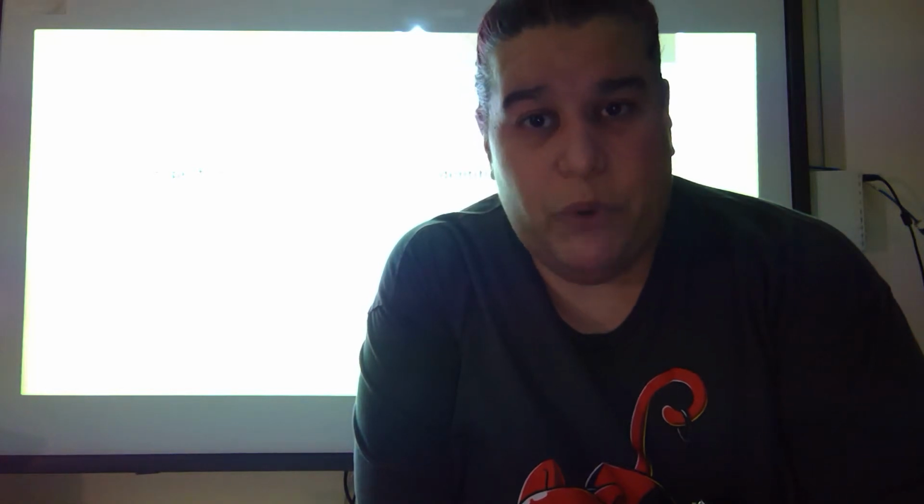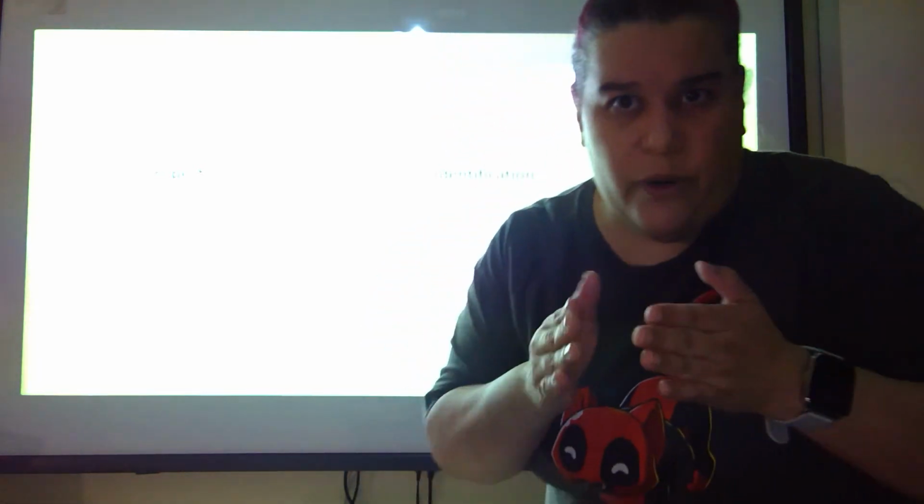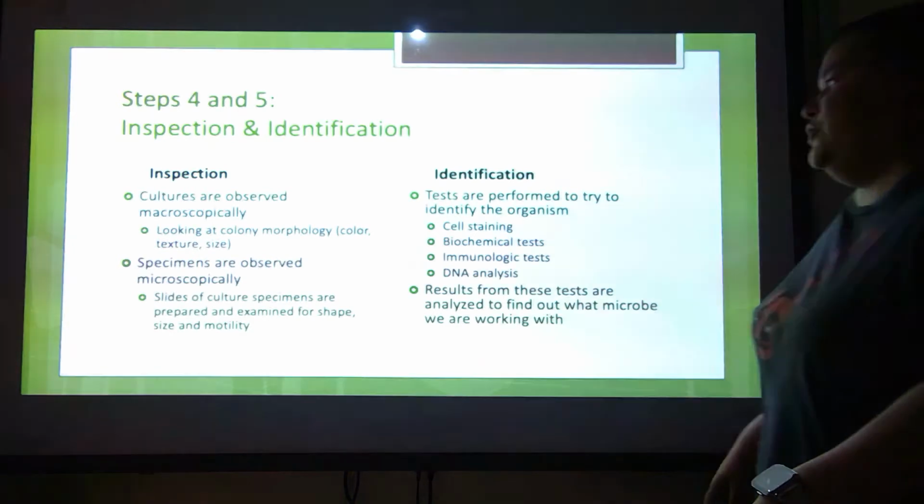However, if I put hydrogen peroxide on it and it bubbles, that means that specific type of bacteria has the enzyme in it and can break down hydrogen peroxide into a gas and water. So you see bubbles. That is another identifying feature for specific bacteria. Some of them can't do it, some of them can. So it's again a way to kind of narrow into your identification.